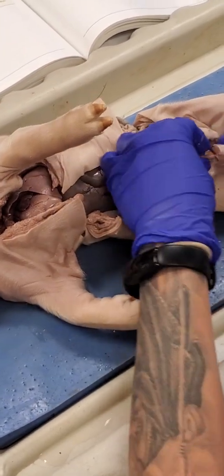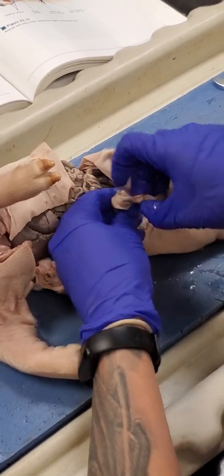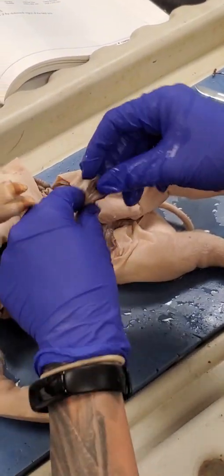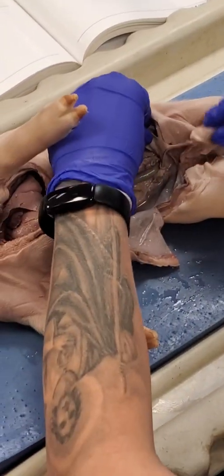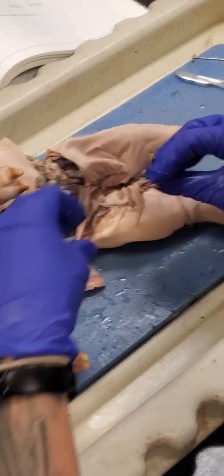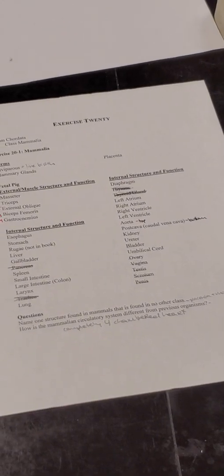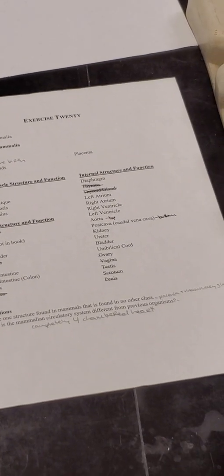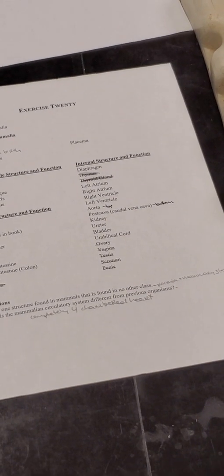So what you see here is part of the inside of the body cavity and the outside. And so I kept that connected. So this thing right here is the umbilical cord. What's that red thing? It's string that they tied around it on the outside of the body. And as for the umbilical cord, that's what connects the fetal pig to the mother, to the placenta. That's where it gets nutrition from.